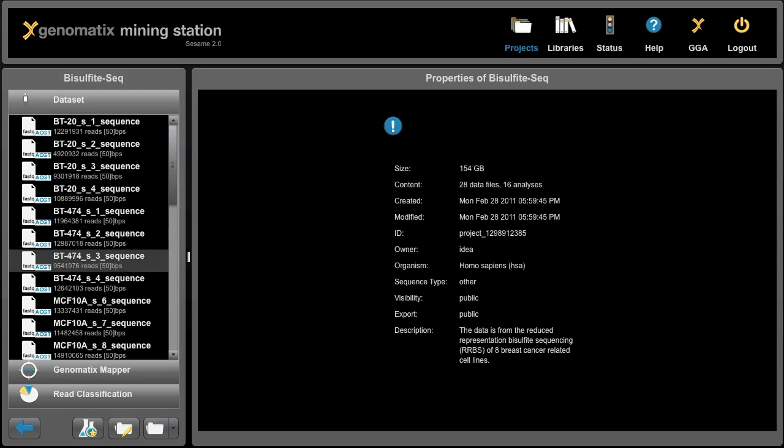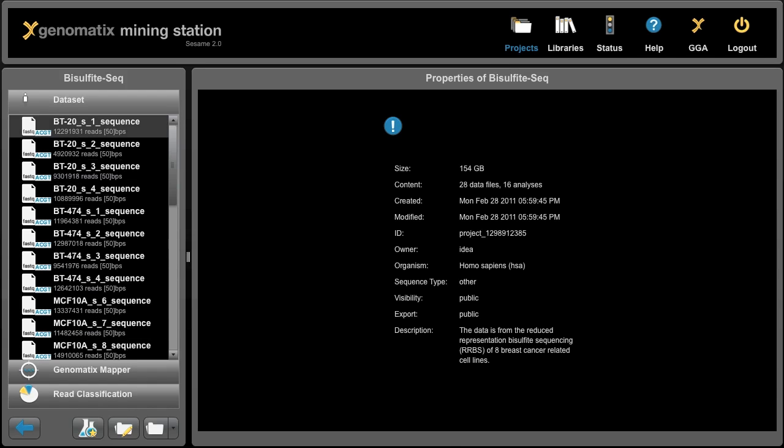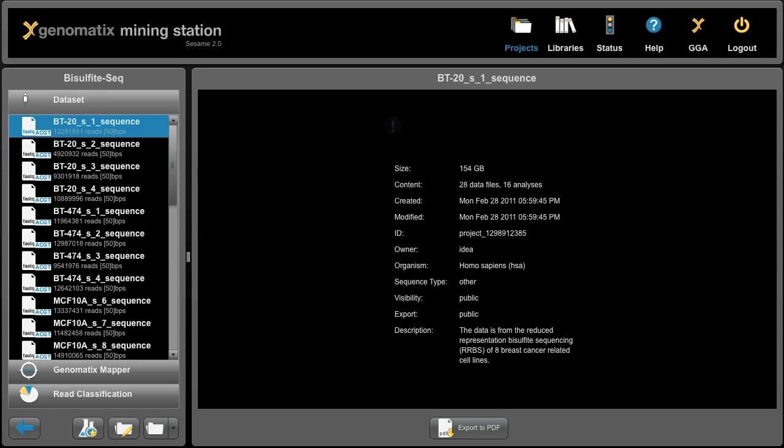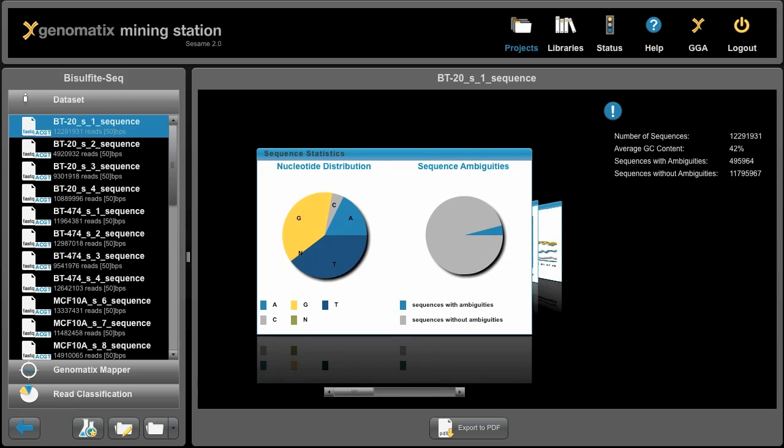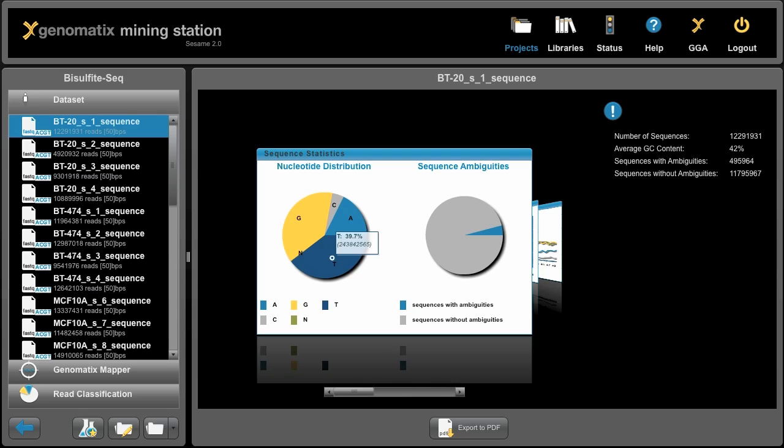Up here you can see the imported read files, and if we click on any of them, we get statistics about the reads. Here we can see that it's a FASTQ file, it's in base code, and we see here that we have a lot of Gs and a lot of Ts, and a small number of Cs. And that's because Cs only remain in the reads if they are methylated.